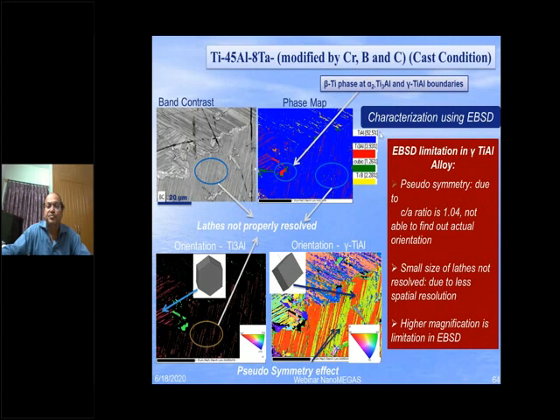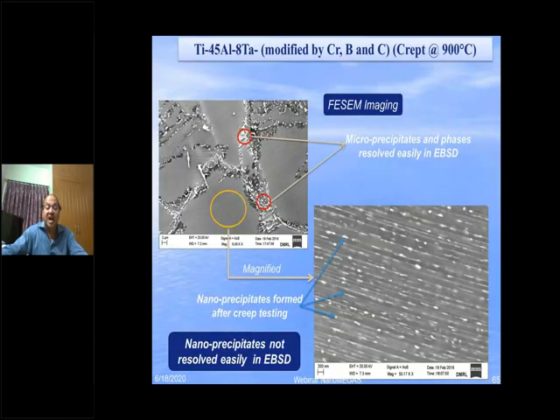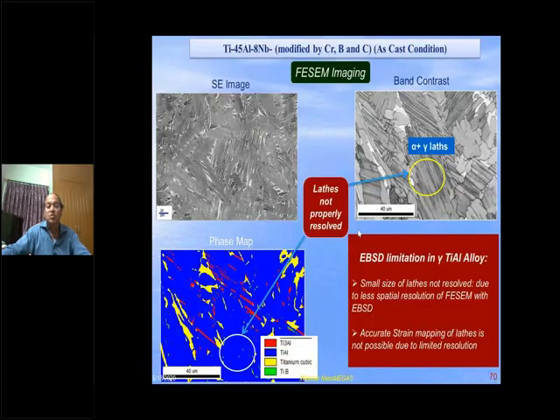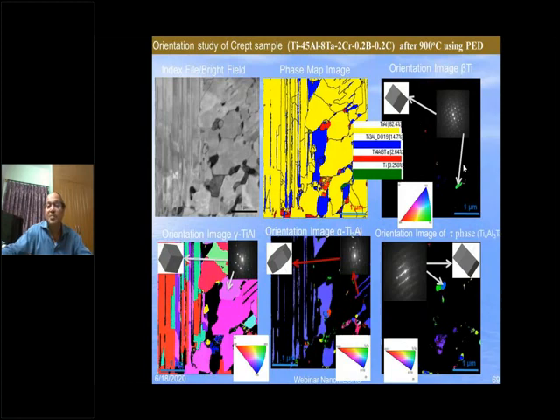What we are doing is characterizing first with EBSD, and what is not possible in EBSD, you jump to TEM. You first make the samples, you go to TEM and start observing these fine things. Any fine or nano or advanced or small phases which we cannot identify and characterize using normal techniques, we start using in the TEM. So basically, this is another one. For these small ones, we take diffraction and then we actually map them.